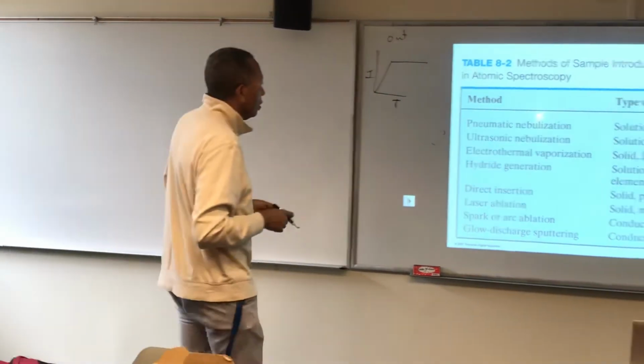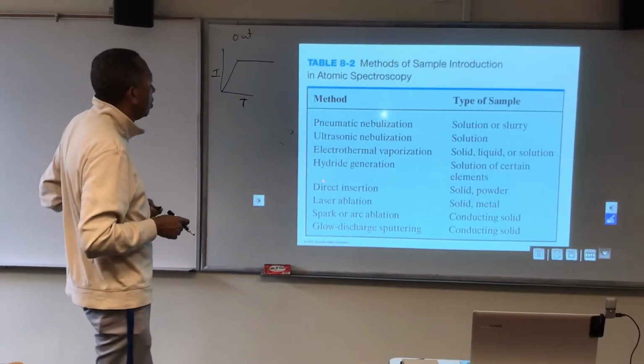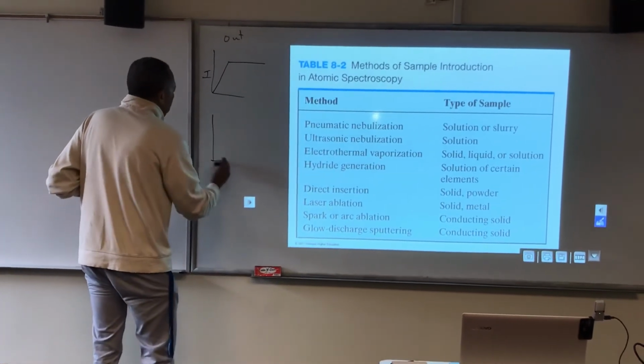When we look at most of these techniques, like laser ablation, arc and spark, electrothermal, they're going to look different.